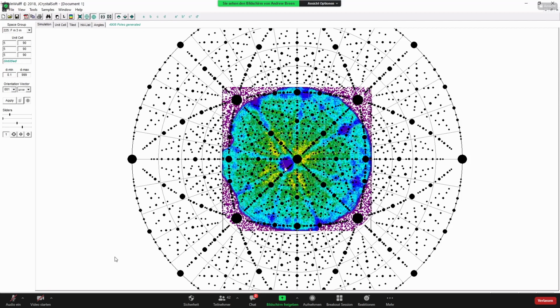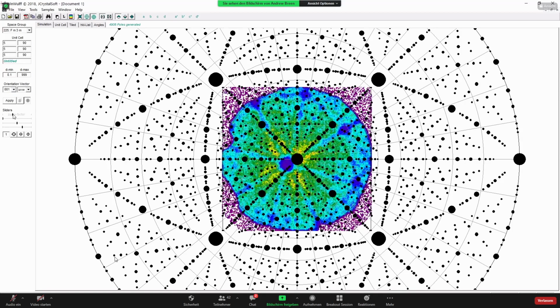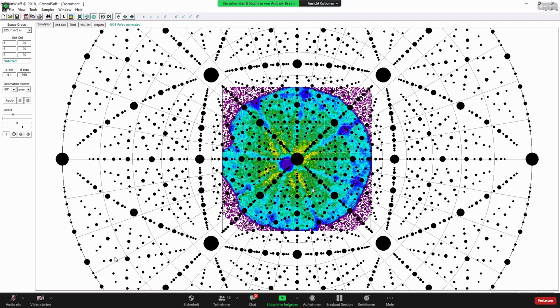You can count out 9 circles to 180 degrees full field of view. So we're only going to go out to about 3 circles, and we should be roughly in close proximity to where we need to be.